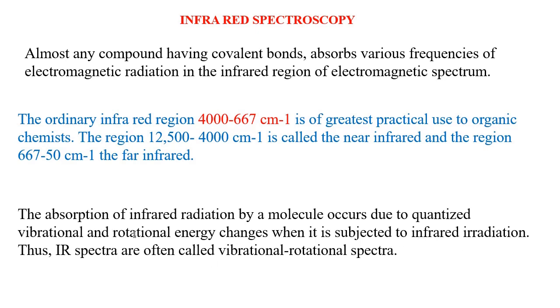That is, when a molecule is exposed to infrared radiation, both vibrational and rotational energy transitions take place, and hence IR spectra are often called vibrational-rotational spectra.